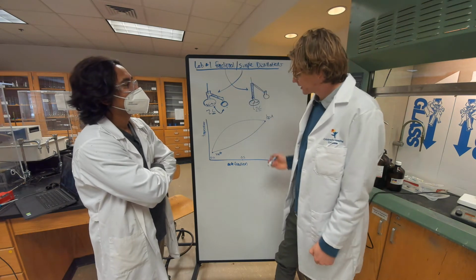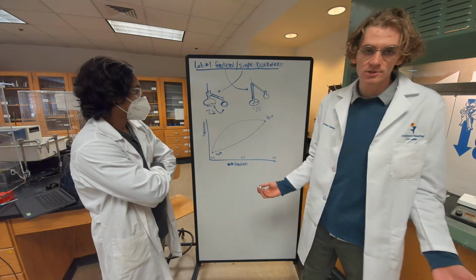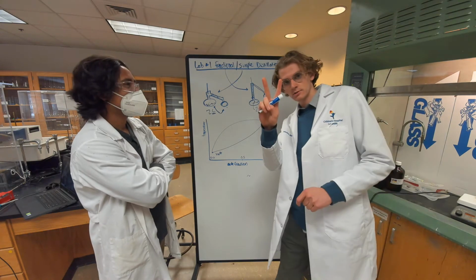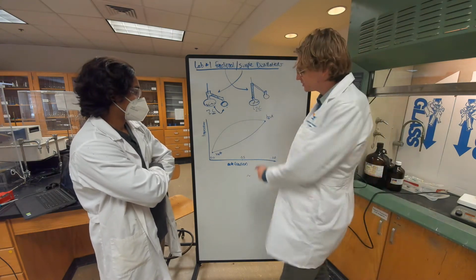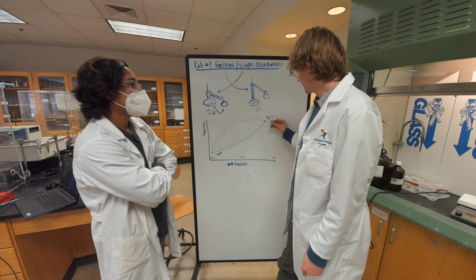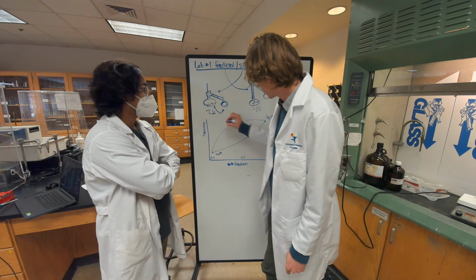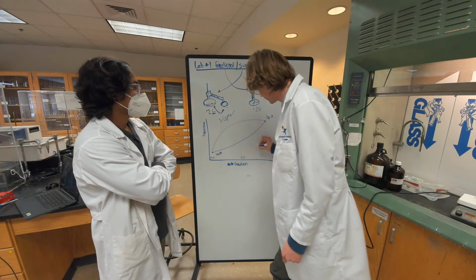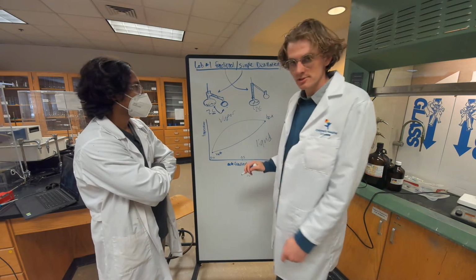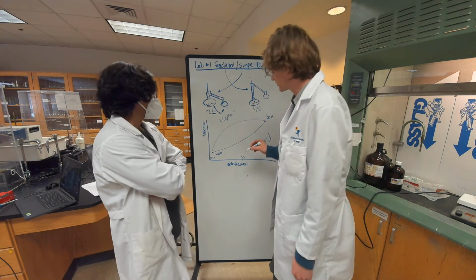It re-vaporizes and recondenses. Graphically, this is shown on the graph of temperature versus mole fraction. I'm just assuming we have two species here. A mole fraction of 0.5 means you have 50% component A and 50% component B. Basically how it works is here you have the vapor phase, and here you have the liquid phase. And what happens is you get this ping pong of vaporizations and condensations throughout the whole thing.